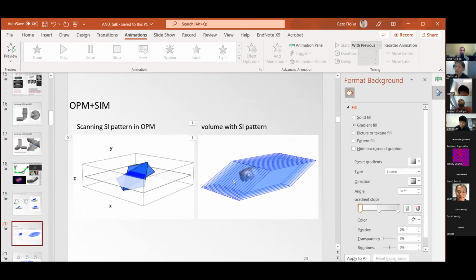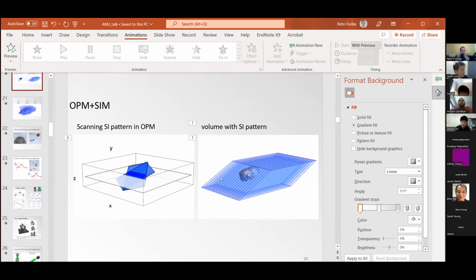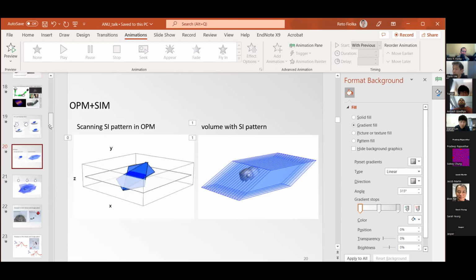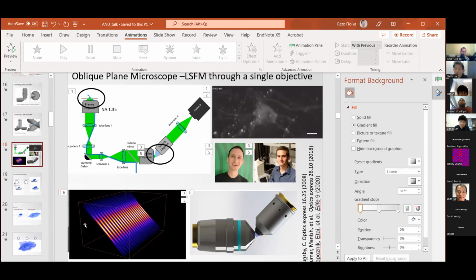Yeah, that makes sense. So whenever I show a normal OPM image, it's actually the sum of the three phase step volumes. That's identical to a non-structured illumination image. Yeah, and I think my next question is on the multi-view aspects of the OPM. Currently you have 3 views, but if you increase the views to, for example, 6, will you actually benefit from the multiple additional views for the image quality?